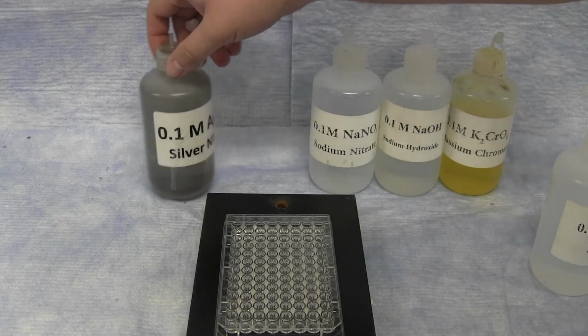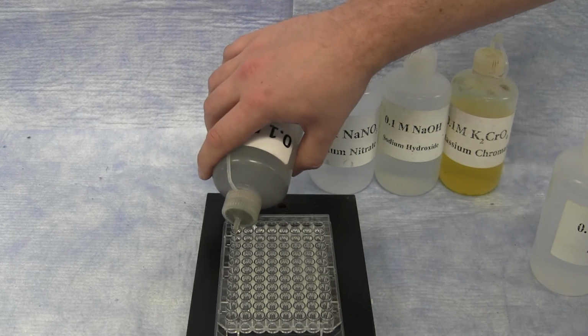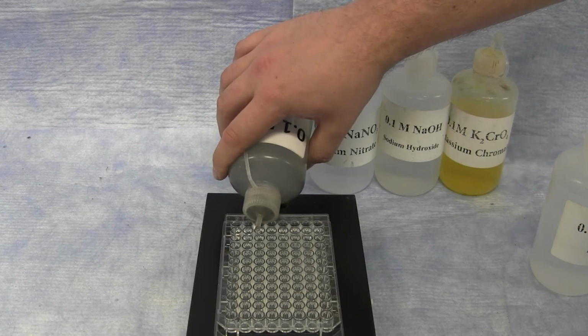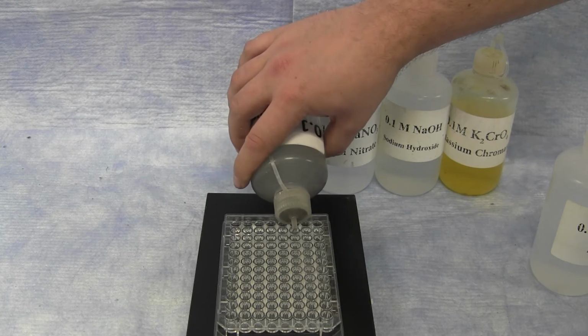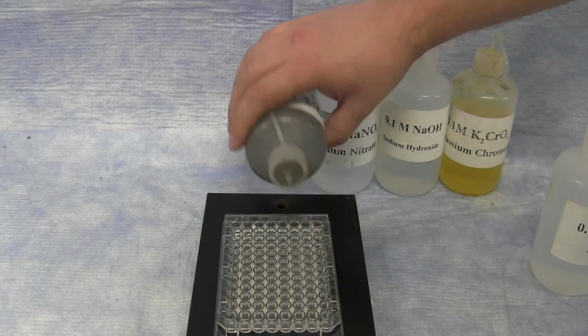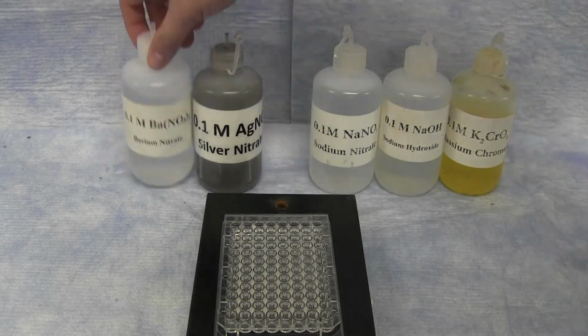There are 12 metal ion solutions in total. However, you will not be given the mercury nitrate solution for safety reasons. The observations of the mercury nitrate combinations will be provided to you, and in the video you can see what they will actually look like.